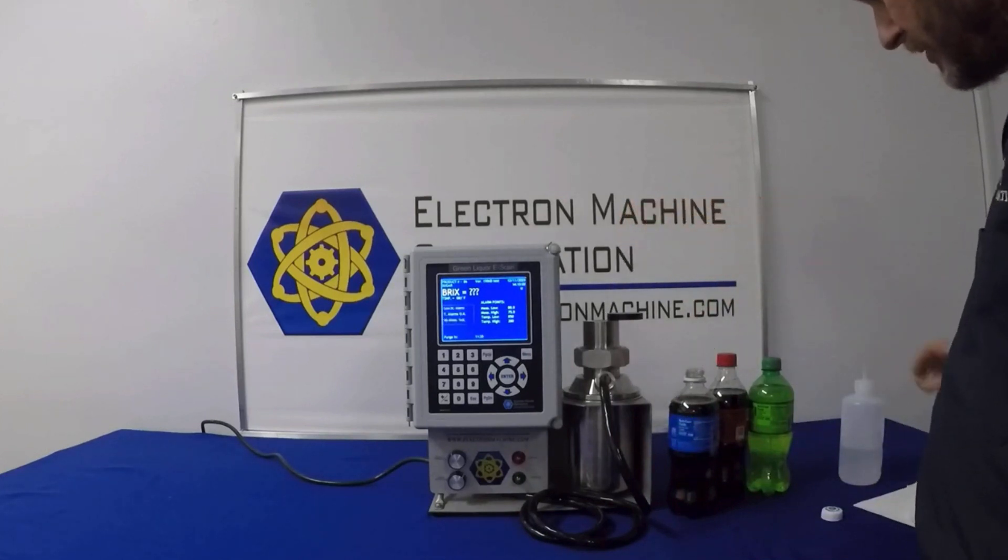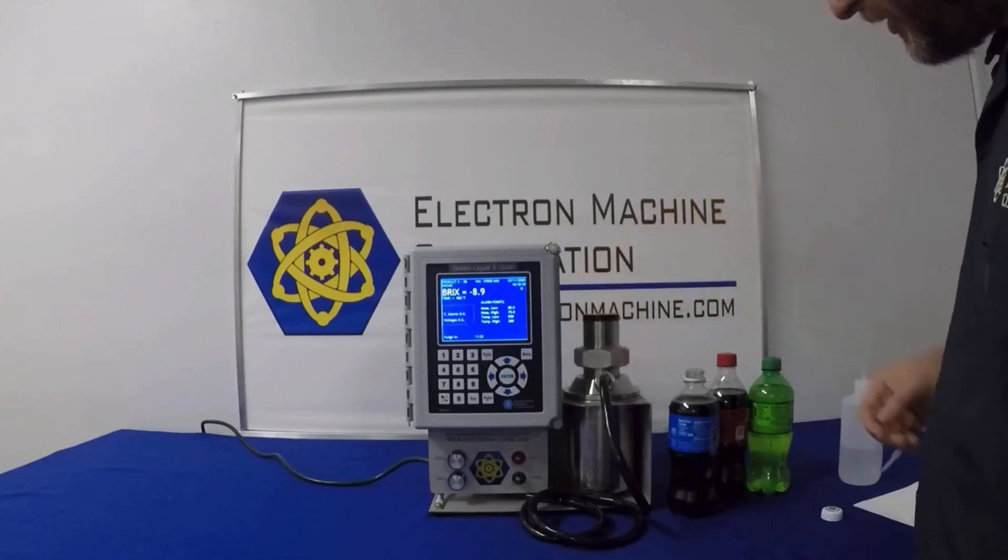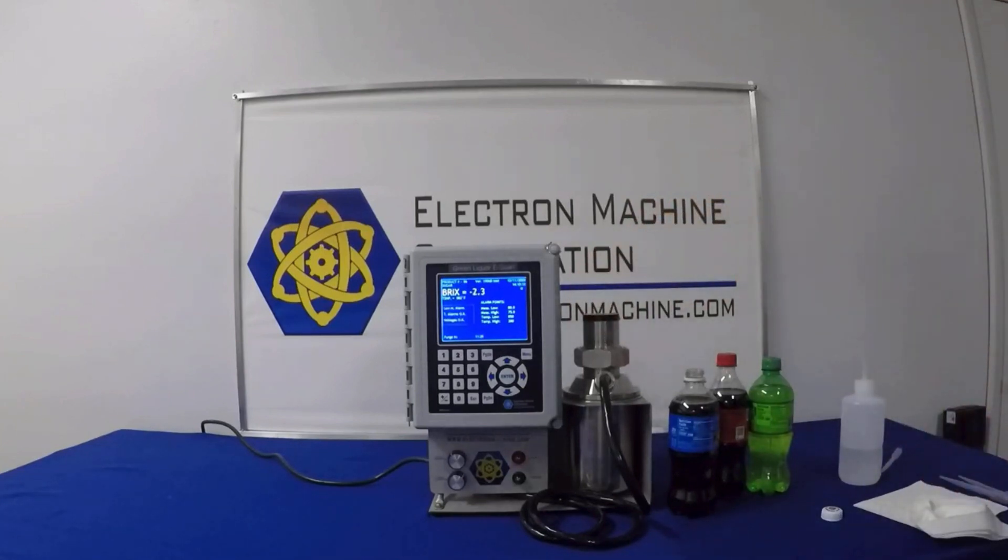Our first soda is from a popular company that uses the blue bottling. We place the sample on. We need to allow the time for the light source to adjust for this. And it looks like we're looking at around a ten brix reading for the blue branded soda brand.